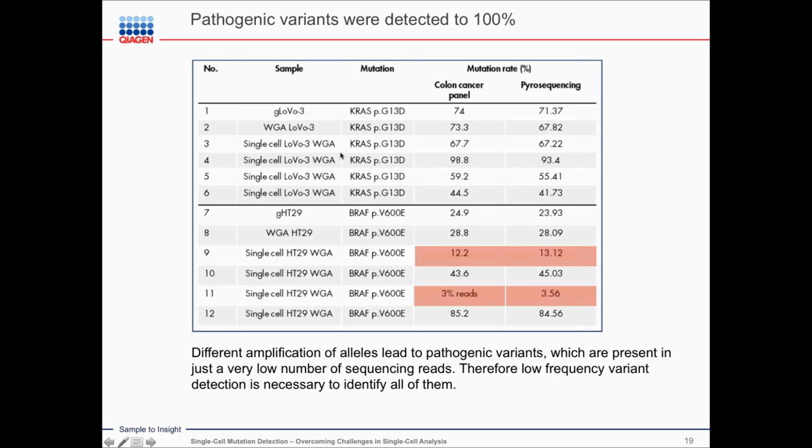So we have really good evidence that this is a great way to characterize the individual characteristics of single cells, as opposed to a bulk amplification where you have a completely different understanding of what the characteristics of the single cells are. And you can imagine that would be particularly useful when one has data coming from different tissue, primary tissue versus mutagenic sample, or metastatic sample.